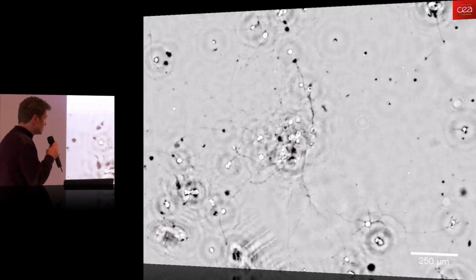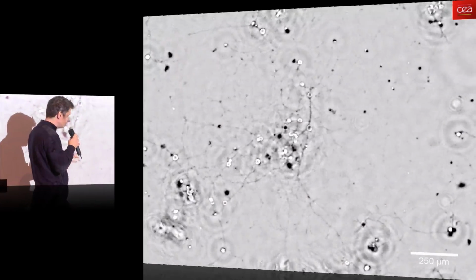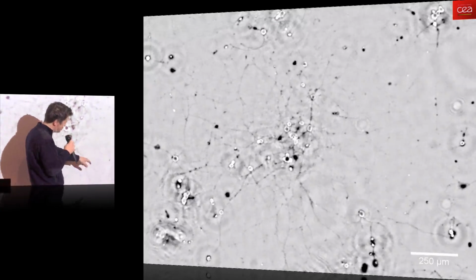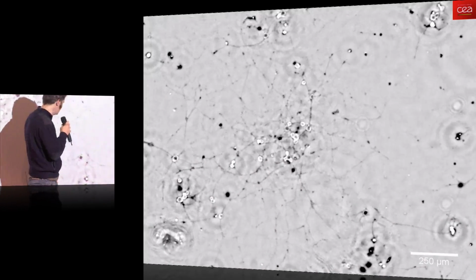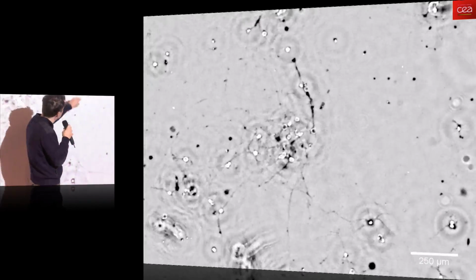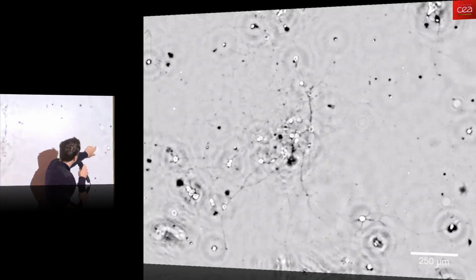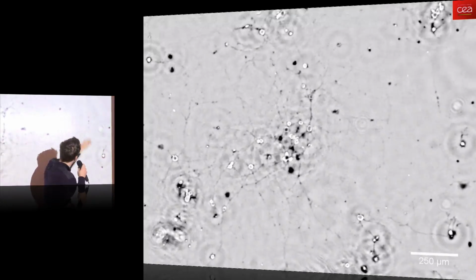These are neurons. So you can see a connection. The resolution is about 1 or 2 or 3 microns, but it's enough to see the dendrite, and it's enough to see that these two neurons are getting connected. Here is a dendrite that is useless, it is removed. You can see another dendrite there. It tries to connect with these cells. So it takes like 20 hours to try to connect, and it will not connect, so it will get back.